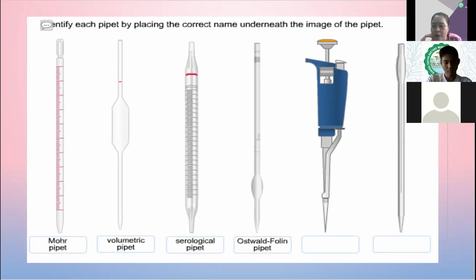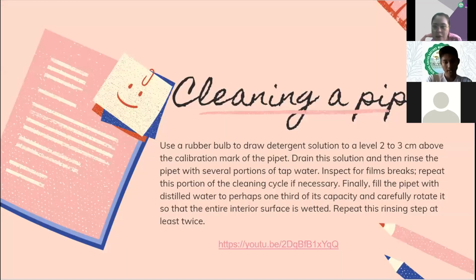When we will have our face-to-face class, let's use them in measuring our volumes of liquids. Now, in cleaning our pipette, I hope nanood kayo sa video kanina. But anyway, I have provided also a link of the videos for cleaning the pipette since we cannot really do this sa atong mga balay.